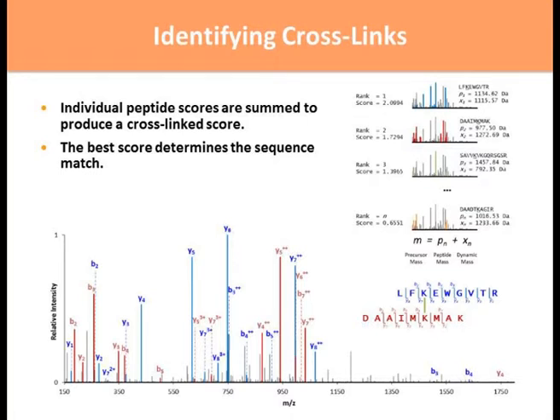What's interesting in this whole process is that even though every spectrum is going to have its own list of peptides, and it's up to the user to define the number of peptides that they keep here, usually we keep 500 or 1,000 of these peptides for each spectrum.